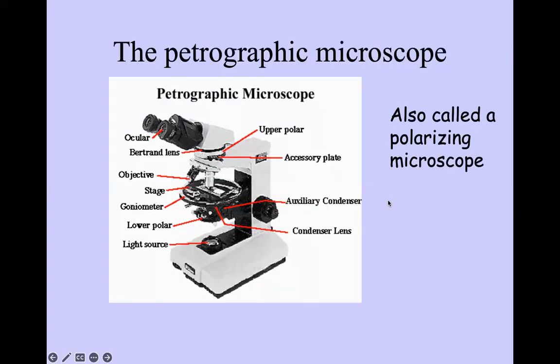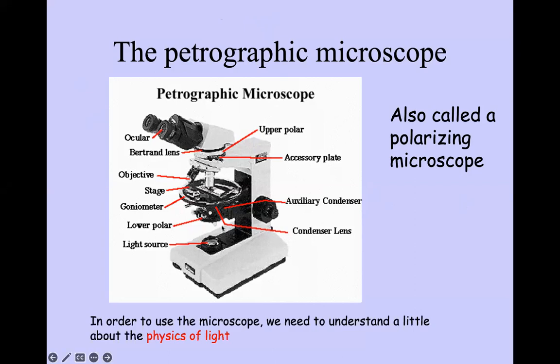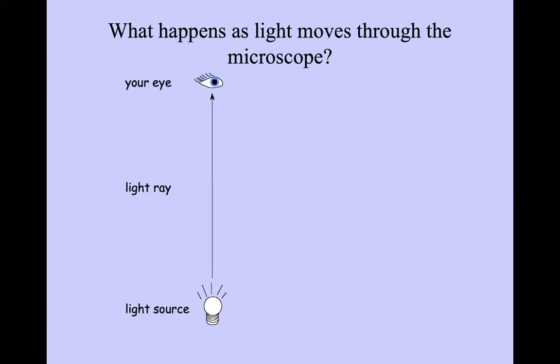Yes. Okay, so we were talking about the microscope, right? The polarizing microscope. I think this is a special kind of microscope, as you now know, because it has polarizers and a rotatable stage. Those are different features than what you normally observe in a biological microscope. So these components are important, right?